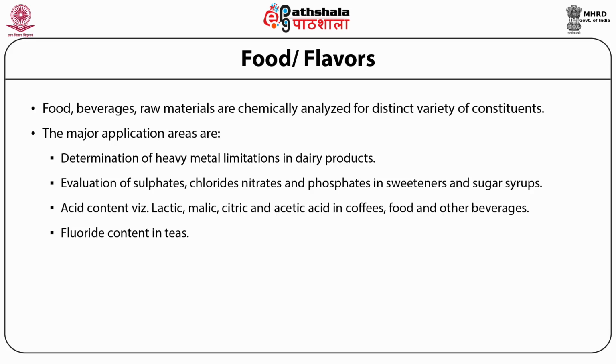exactitude, reproducibility, etc. It can be applied for the purification and separation of charged molecules, for example, enzymes, proteins, DNA, nucleotides, peptides, vitamins, antibiotics, etc.